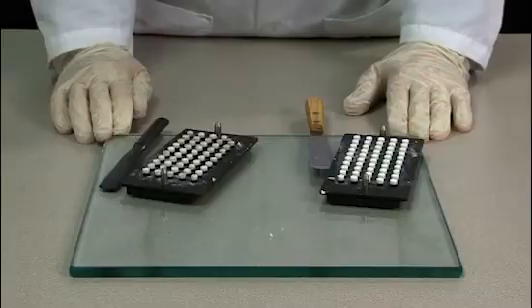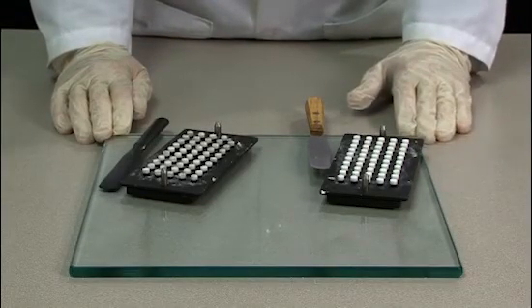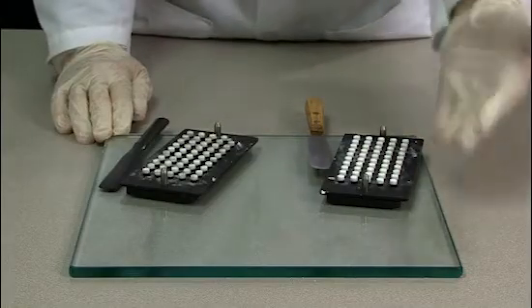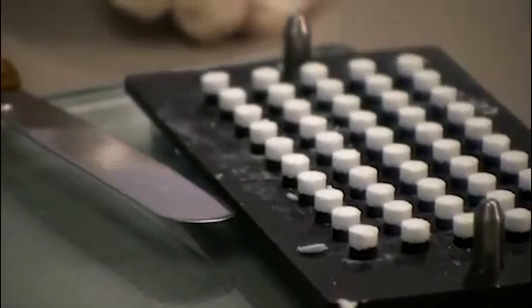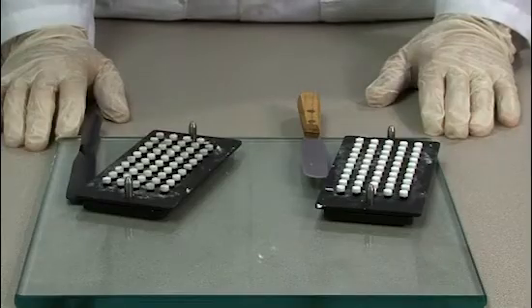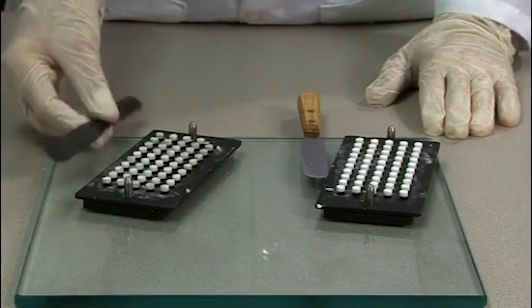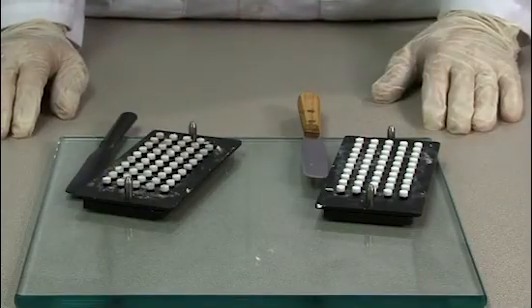A way to determine if that's true or not is to make another set of tablets using a different kind of spatula, a stainless steel spatula. And if you look at the tablets made by the stainless steel spatula, you notice that they are quite white as compared to the ones made with a hard rubber spatula. Therefore, the color is not coming off of the cavity plate, but the color must be coming off of the hard rubber spatula, since the stainless steel spatula does not cause the gray tablets.